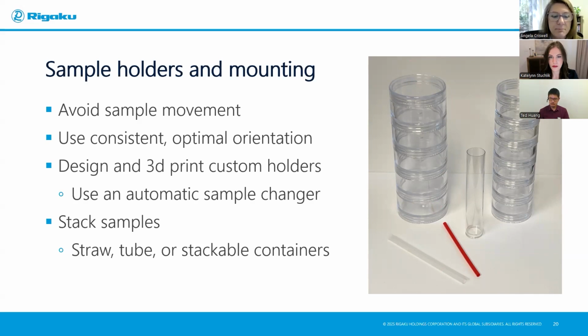So with sample holders and mounting, think about how you can do this in an efficient way so that perhaps you don't have to be at the instrument for every single measurement.